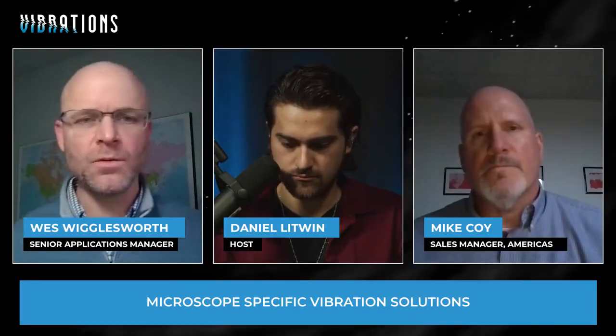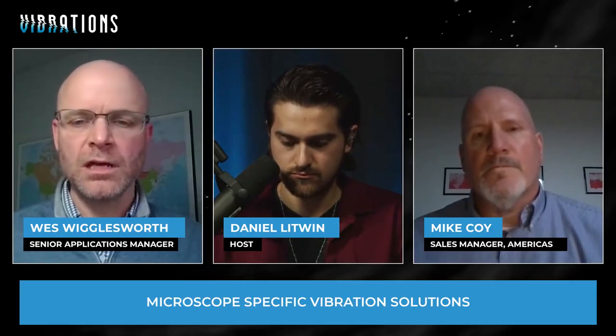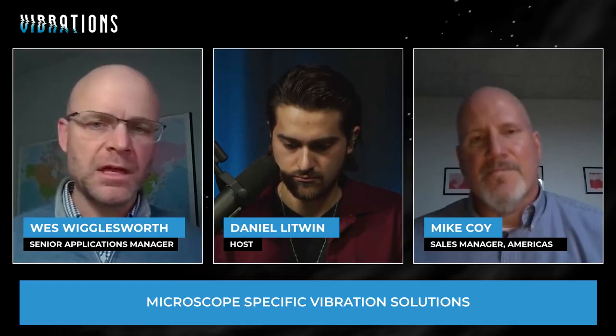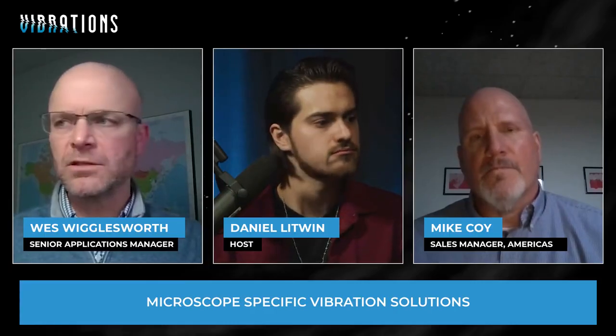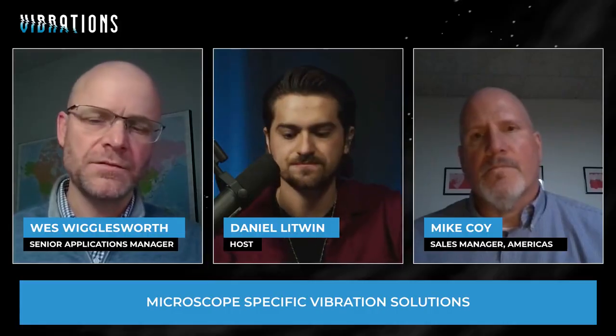It's fairly lightweight. I mean, we have a lot of mass. There's a lot of steel. These bases are always heavy. One person can't just walk into a room carrying it under their arm, of course, but, relatively speaking, it's very easy to install, get into the elevators and down to the basement level that Mike mentioned earlier, fairly easily. So that's a really nice off the shelf solution.